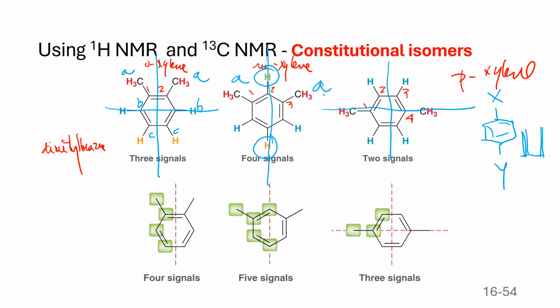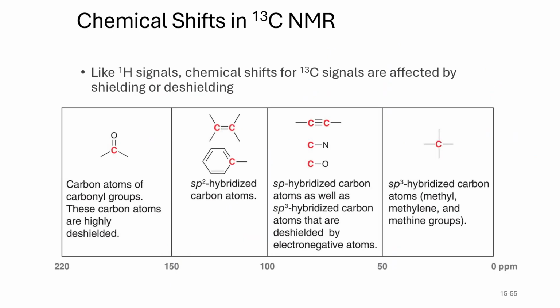This is doublet, doublet. That's a pattern for that. This is carbon. Remember, this is a type of carbon. So you have, again, planar symmetry. So A, B, B, C, C, D, D. And that is the ortho. So again, you may be asked, how do you distinguish these molecules using IR or using NMR or using carbon? So that is the idea, identifying the number of signals.